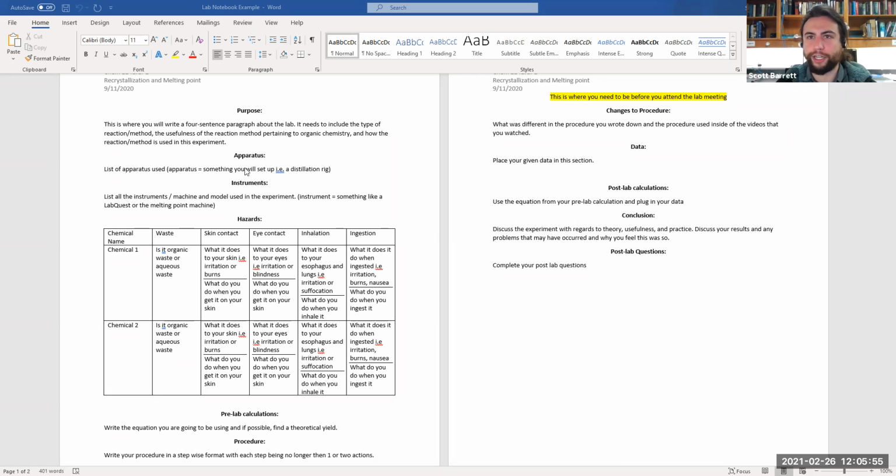The vacuum filtration apparatus would consist of the vacuum filtration flask, a rubber stopper in order to secure your ceramic filtration vessel, and just make sure to list out every individual component, not just vacuum filtration apparatus, because that's too generic. We need to know the tools that you would be using walking into a lab.